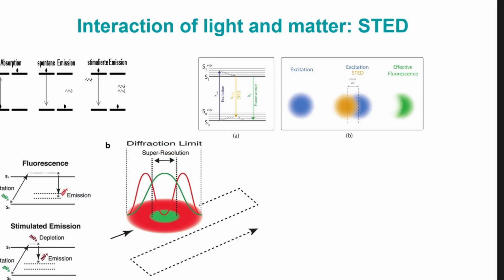Well, I cannot make the laser spot smaller than a certain limit because of the diffraction. Laser spots are just as much subject to the law of diffraction as anything else. So focusing the laser spot to a smaller one is not going to work. Eventually we start to see diffraction. So somehow I should try to limit the size of the active laser spot, the laser spot that actually activates molecules to fluoresce, as small as possible without actually trying to make the spot itself small.